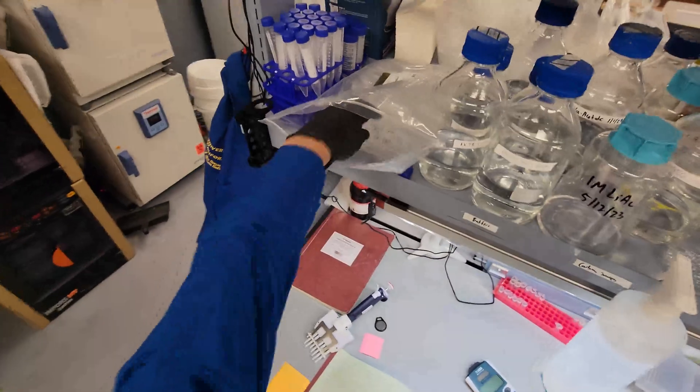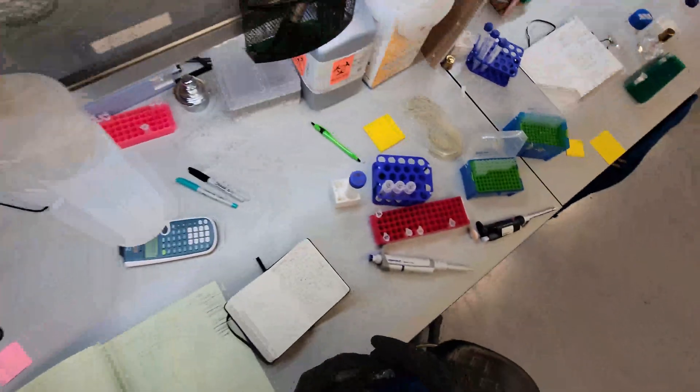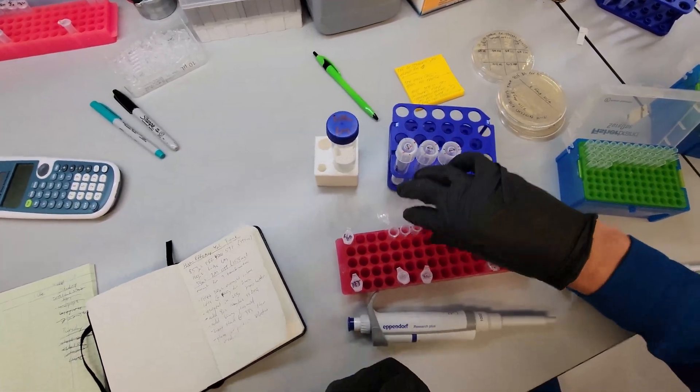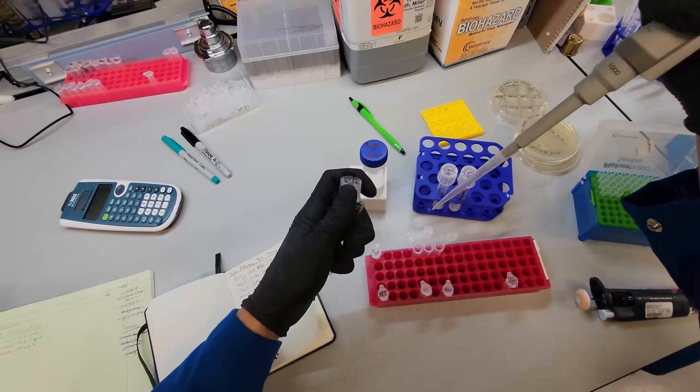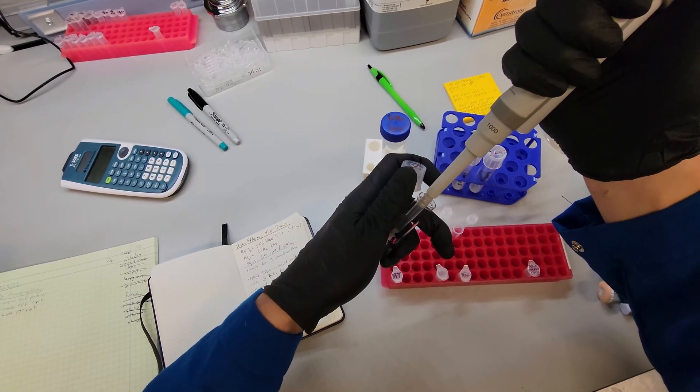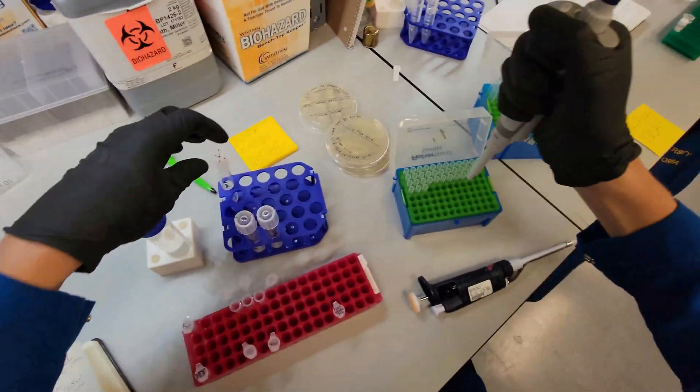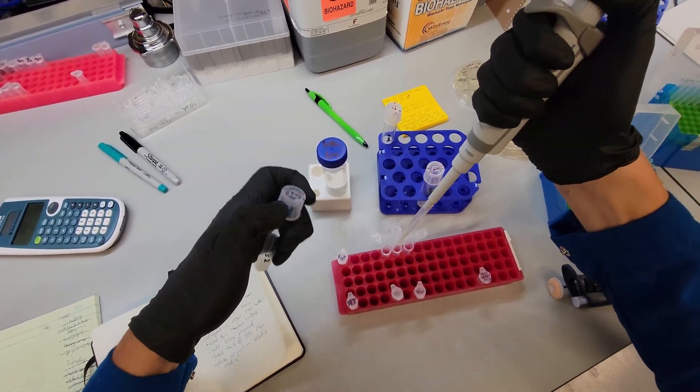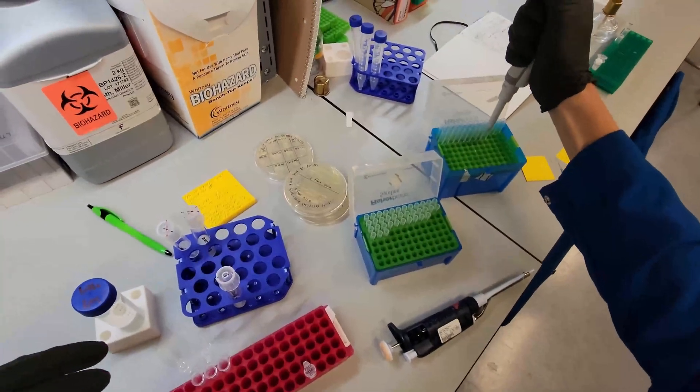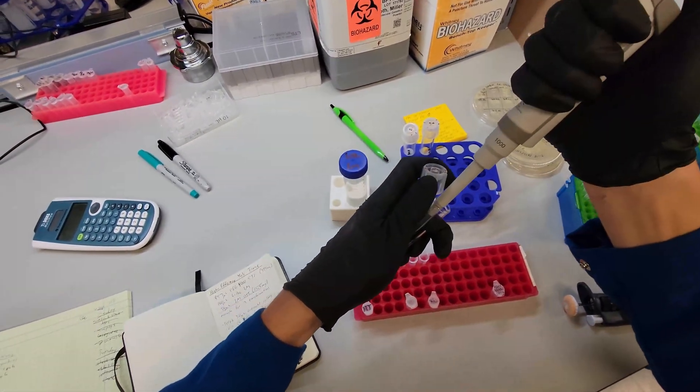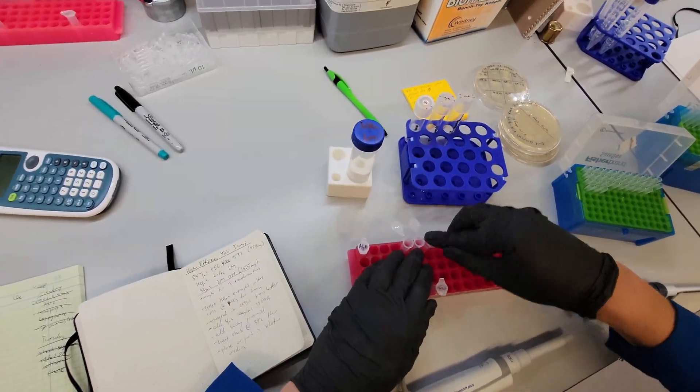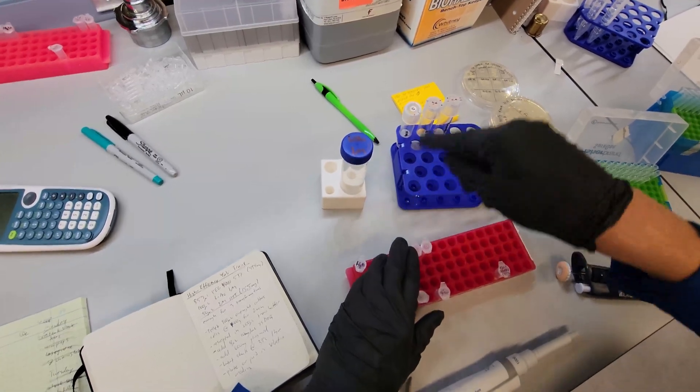So first what I want to do is collect our cells. With the cells, you want them to be in stationary phase. You don't want to use exponential phase cells. There's a lot of other transformation protocols for other organisms that specify early exponential phase cells. I think, especially with Saccharomyces, that's common. But for whatever reason with Yarrowia, stationary phase cells work the best. And even like late stationary phase cells can be better than early stationary phase, which is interesting. So these cultures have grown at 30 degrees Celsius for about 24 hours in YPD media. We don't need to be super sterile with these because we're done with those cultures.